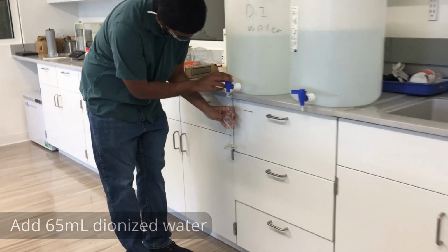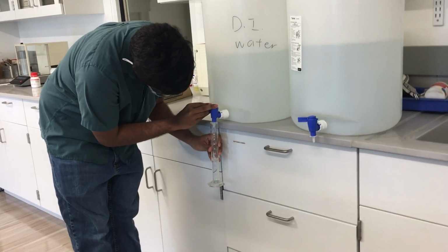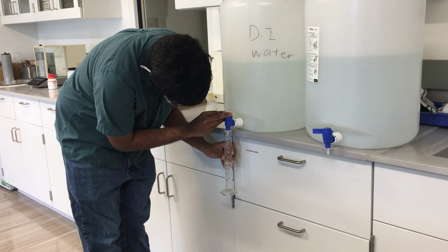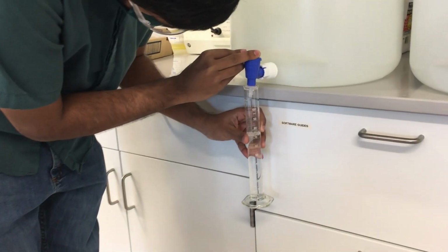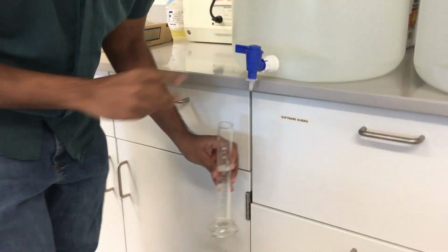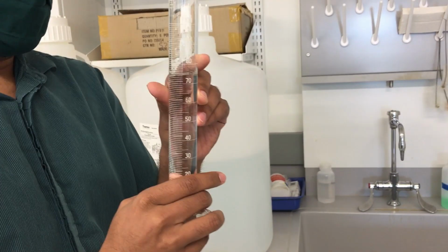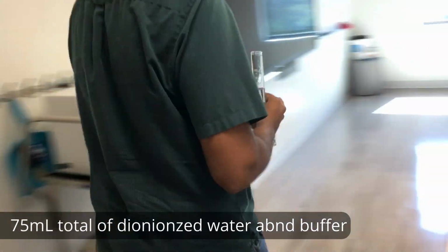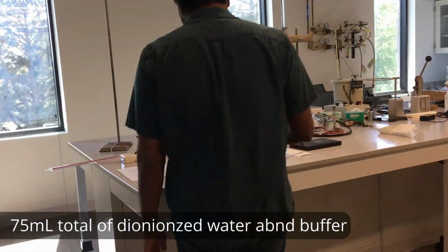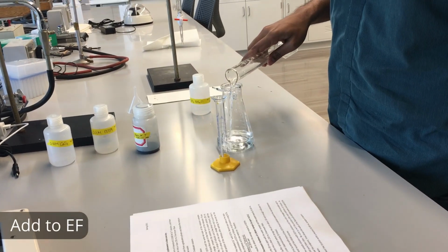Now in this lab, there is a big difference between the deionized and the non-deionized water we use, because we're going to be using regular Georgia tap water in the second part to measure its hardness. Here we just use deionized water, which has no ions in it, just H2O, to get a dilution of our buffer. So you can see that we have about 75 milliliters total of our buffer and our DI water right now. We'll go ahead and add that to the Erlenmeyer flask.